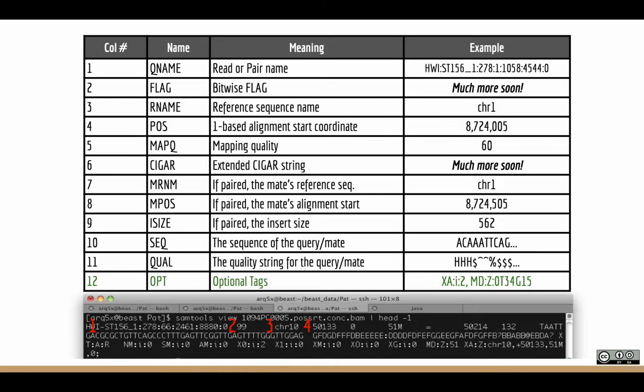Imagine that 51 base pair part of the reference genome to which this read aligns occurs 1,000 times in the genome. That's why it's going to get a low mapping quality. I put it here, but it could go to any one of these 999 other places equally well. So it's reflecting the uncertainty in the actual location rather than the alignment itself. So in places in the genome that are repetitive, you're never going to get a high score there. That's right.